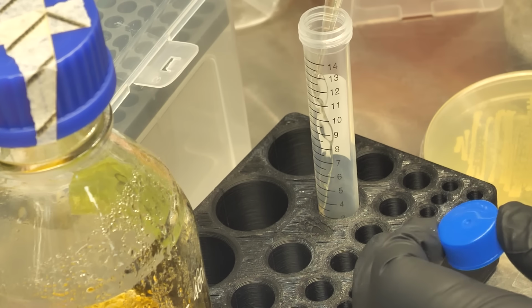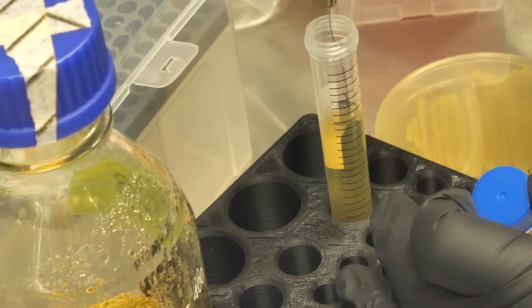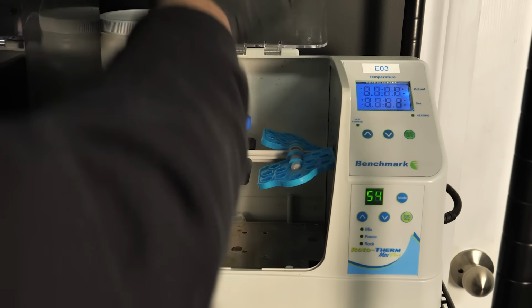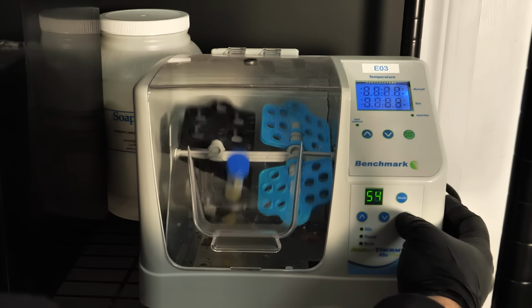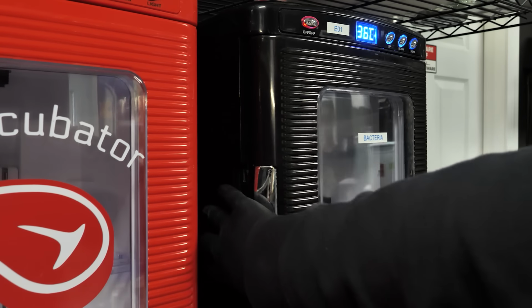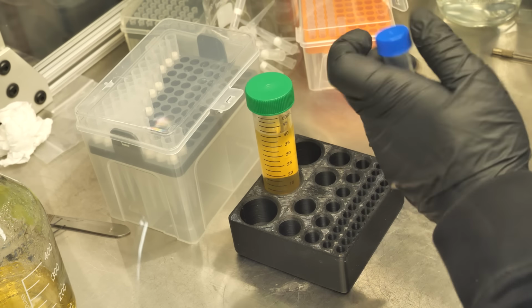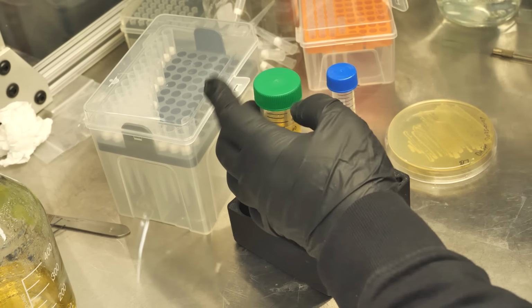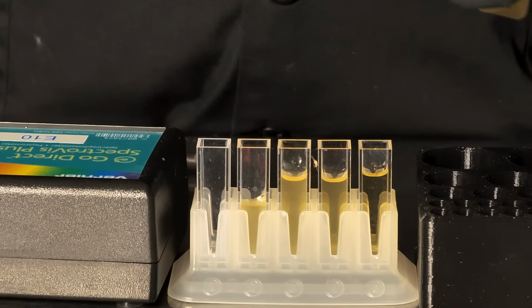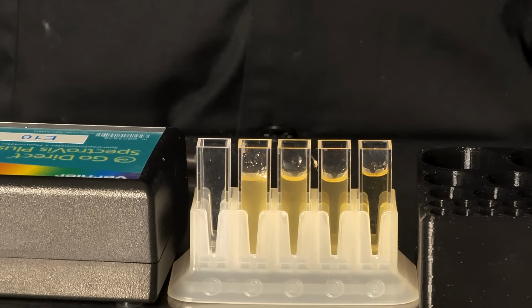Alright, now with sterile growth media ready, I can inoculate 10 milliliters of normal LB with our E. coli. Then I'll pop it into my Tippy incubator at 37 degrees and leave it to grow overnight. You don't actually need one of these, a regular incubator works just fine, but these do make the bacteria grow a little better. The next day, I'm going to use 500 microliters of this solution to inoculate another 40 milliliters of LB. But this time, we're going to monitor it closely for a few hours. What we're waiting for is the bacteria to be in the middle of what's called log phase.